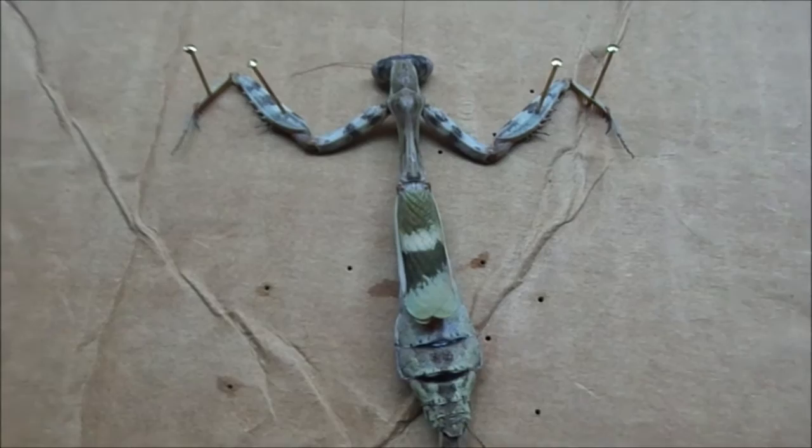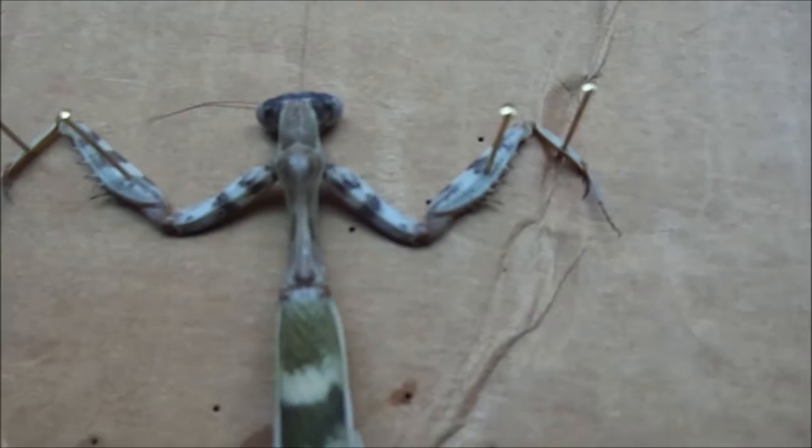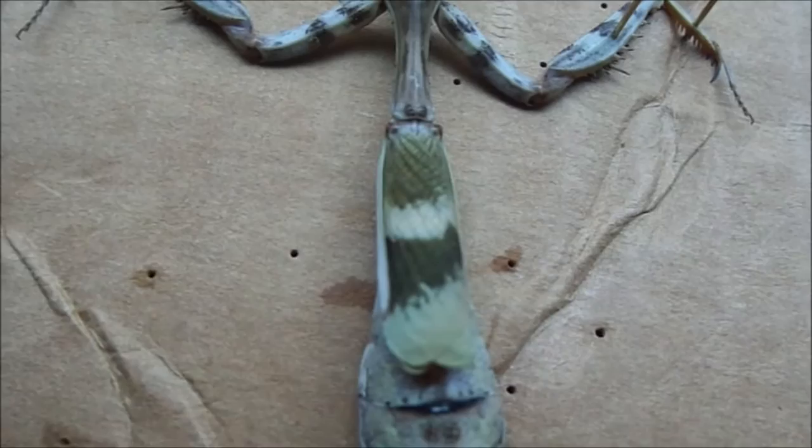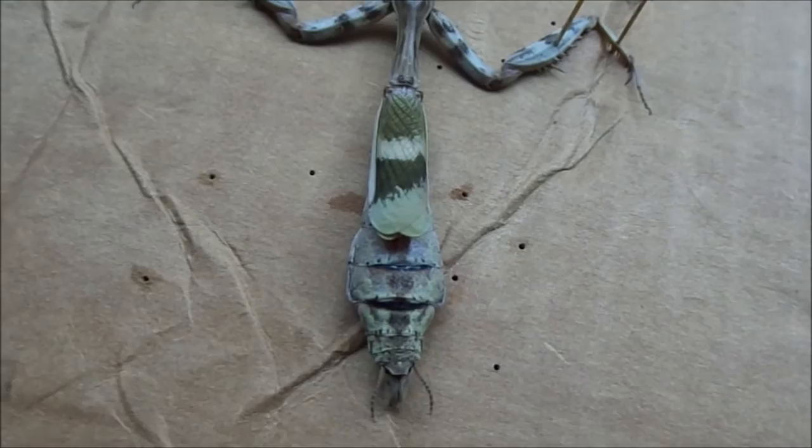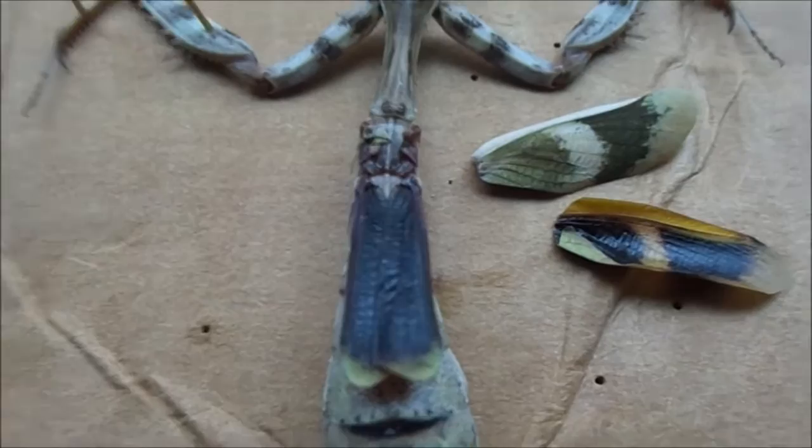This is the same mantis, now the dorsal view so you can see the back — the head is facing down, arms splayed out. As I said, this is a bud-wing mantis, so it has these little vestigial wings. Normally in female mantises these wings would extend right the way down almost to the end of the abdomen, but these are vestigial, which means they're not actually used for flying — so these mantises are flightless.